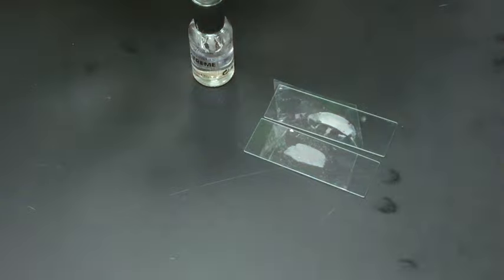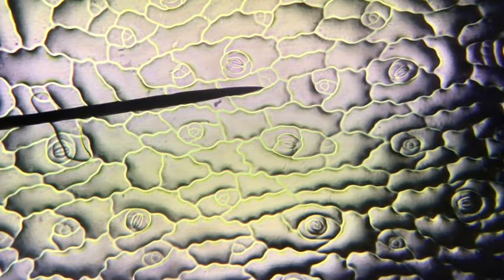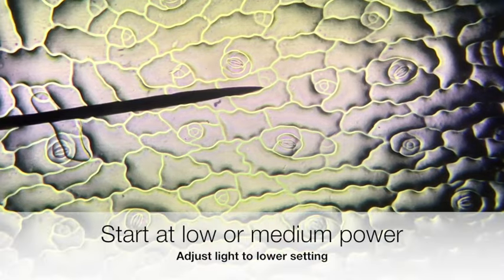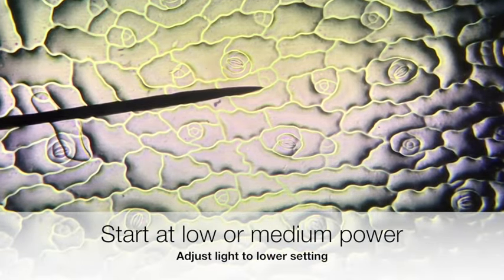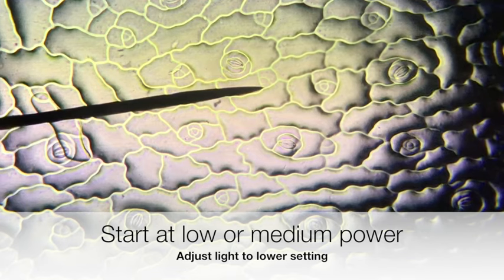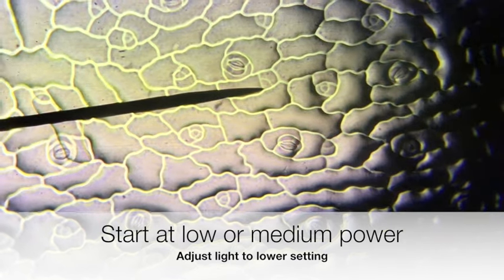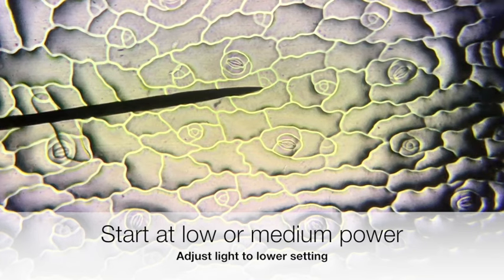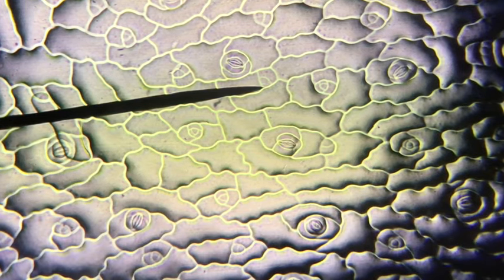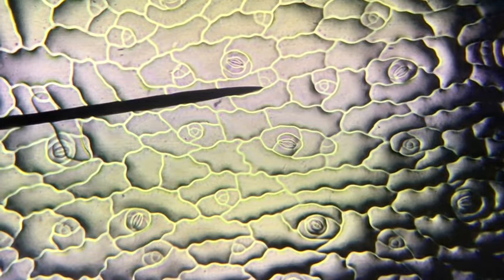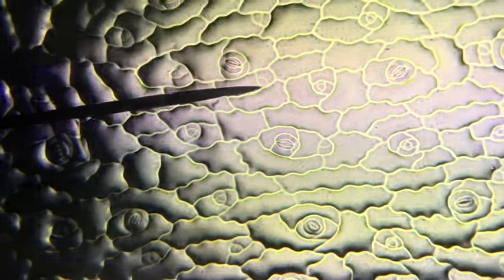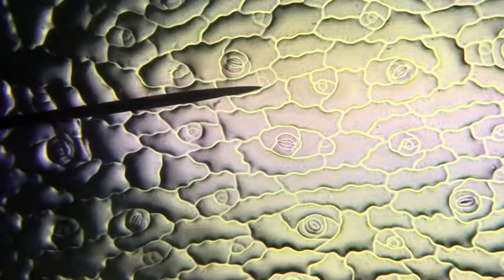Alright, so here I've got the succulent under 100 times magnification. I had started under 40X and didn't feel like I needed to zoom in on any particular stomata or stoma. They're definitely in the field of view, there's definitely about, I don't know, 5 or 10 of them. I'll switch to high power.